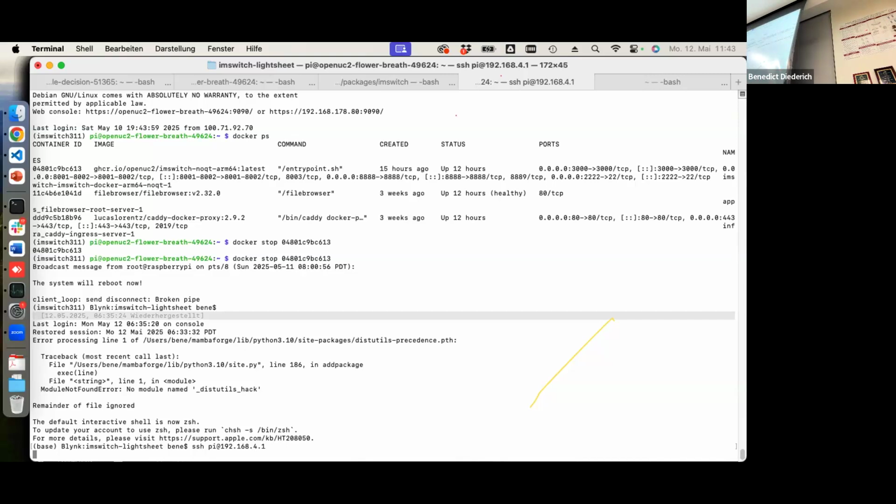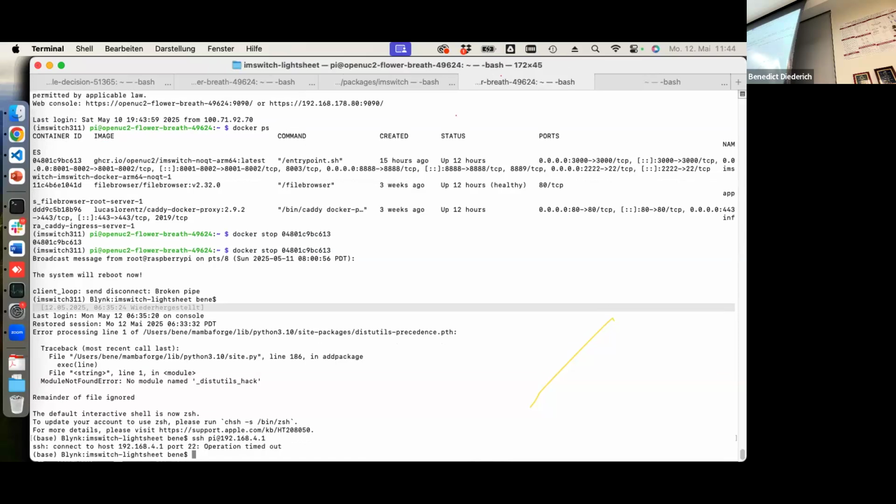So you want to build a confocal microscope? Yes. Nice, that's a very good one. It's already pretty difficult. You see, here you can nicely draw boxes around it and then you're done. Yeah, exactly. Is that the 50%? Almost. To me it's a bit like a light bulb, and not like a reflector.